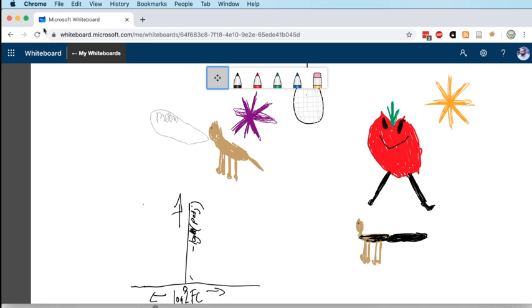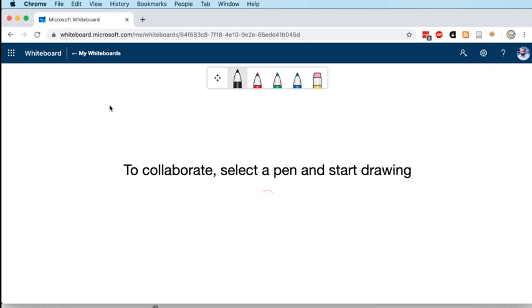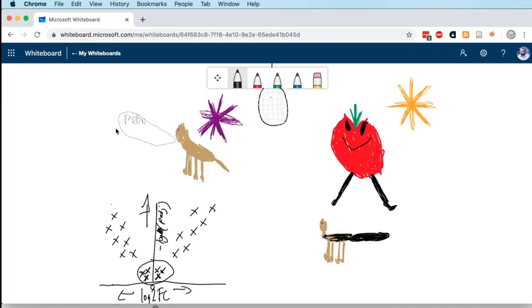just refreshing because it's not keeping up with me, where you've got a little cloud of points down at the bottom, and then it kind of radiates out from the center, and it does often end up looking like a volcano. There you go. That's my rough representation of what a volcano plot ends up looking like. So that's what we want to draw. That's what we want to produce in R.